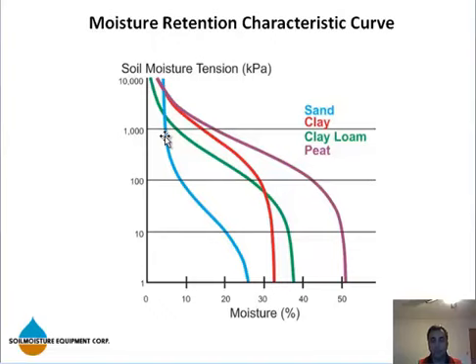And the other thing is that your pressure range might be different. Sometimes it's from 0 to 1 bar, sometimes 0 to 5 bar. And if you are doing the whole range in agriculture, it is 0 to 15 bar, which basically is known as permanent wilting point. Most plants and crops die at that point, so there's no point for going beyond that pressure. That is why our extractors can go up to 15 bar maximum.